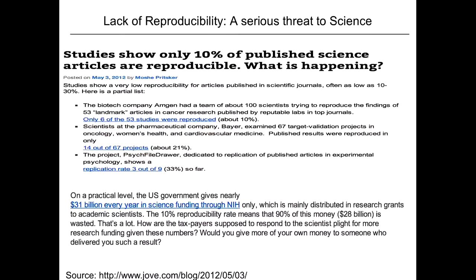Neither of these conclusions is necessarily correct. I'm not saying that everyone is highly competent. I'm also not saying that no one is cheating. This unfortunately happens. But for the most part, I think that when something is not reproducible, there are underlying variables which we simply do not understand and cannot control. And then the results will be different because some confounding factor is applied in someone's research laboratory and not in the other, and that leads to different results. So finding these factors and eliminating them would be an important issue in experimental science.